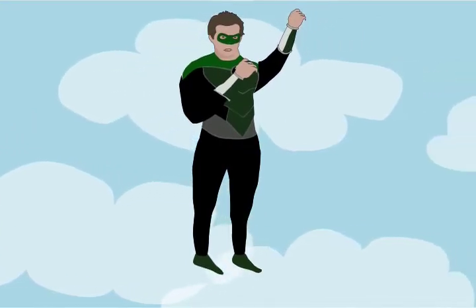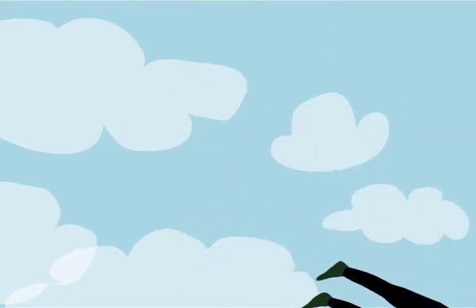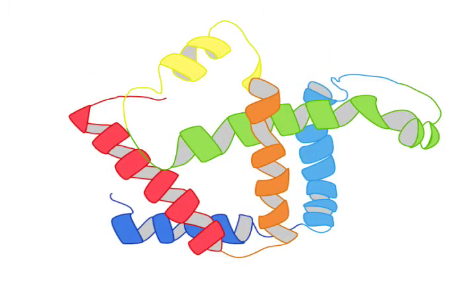Tomorrow, you will have the opportunity to perform a lab that is typically done in college or a biotech industry. We will be isolating proteins from Escherichia coli, a prokaryotic cell found in places like your intestines. Proteins are purified because scientists learn from studying the structure and functions of proteins.